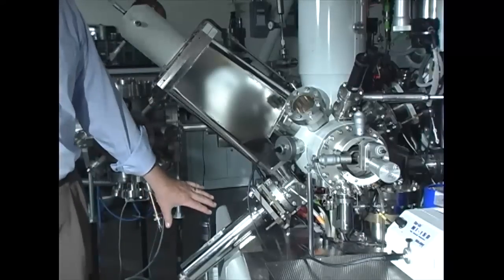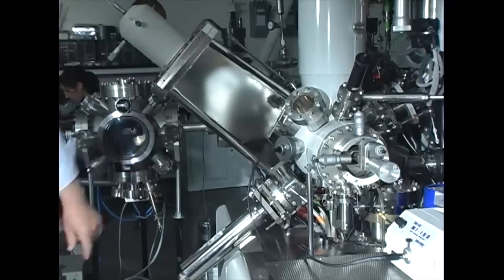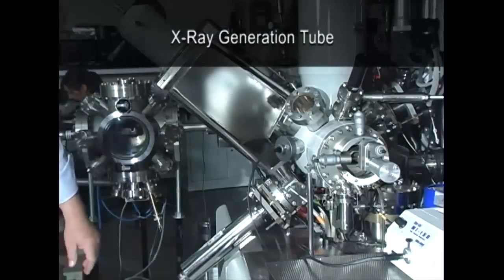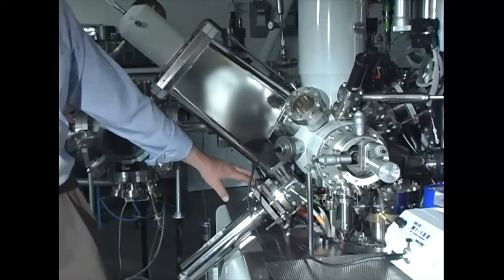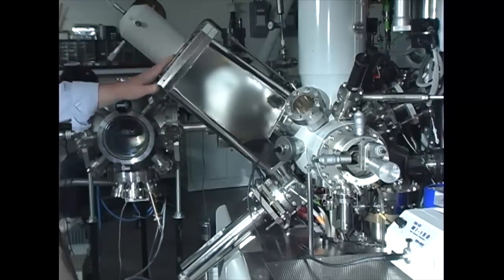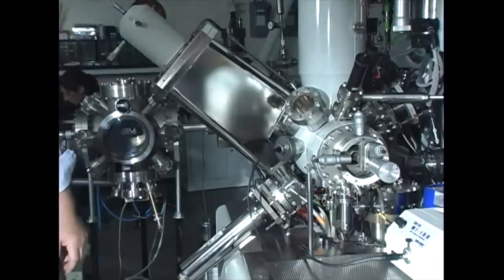So one of the key features of modern X-ray photoelectron spectrometers is that we use monochromatic X-ray sources as opposed to what we were using 20 or 25 years ago. This is the actual X-ray generation tube right here. We use a high energy beam of electrons to strike a target material. The target material then gives off X-rays, in this case aluminum K alpha X-rays, which are brought up to this quartz crystal monochromator along here, and then finally brought to focus at the actual sample.